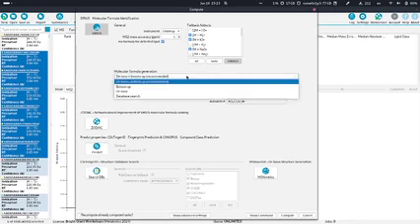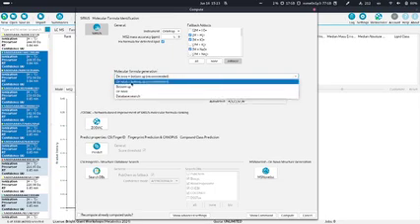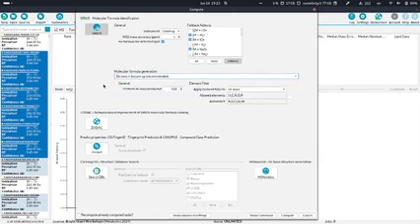And I think in SIRIUS 5, there were more settings for the database search, which is also now here in this drop-down menu, where you can just use any structured database and just be able to predict or annotate formulas which are present in these structured databases. But in most cases, the recommended setting is to just leave it as de novo and bottom-up.